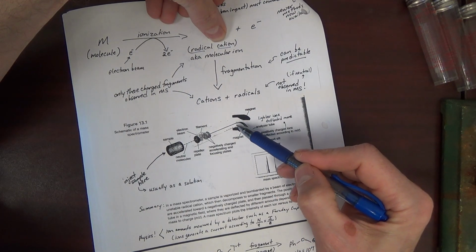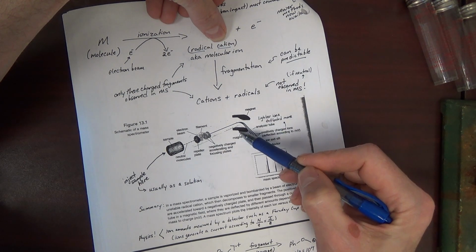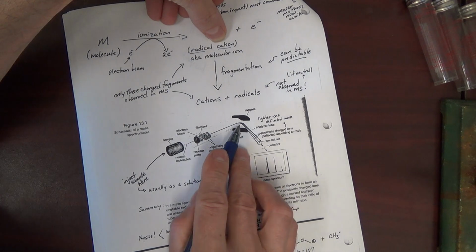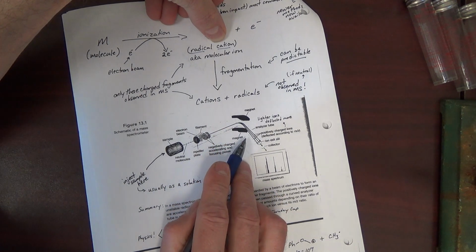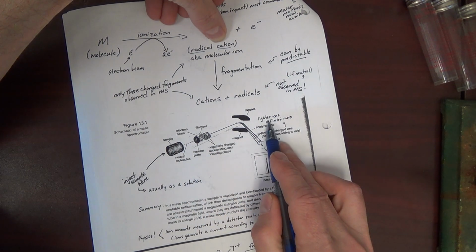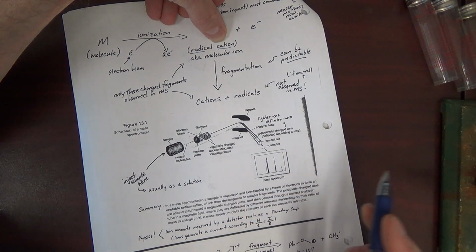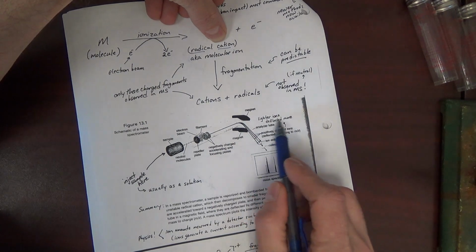Okay, when a charged particle moves into a magnetic field, there will be a force acted upon that charged particle. This is physics. The charged particle will be deflected by the magnetic field. But it turns out that the degree of deflection corresponds very nicely to the mass of the particle. That is, lighter ions will be deflected more by the magnetic field. Heavier ions will be deflected less. But that's a very linear relationship.